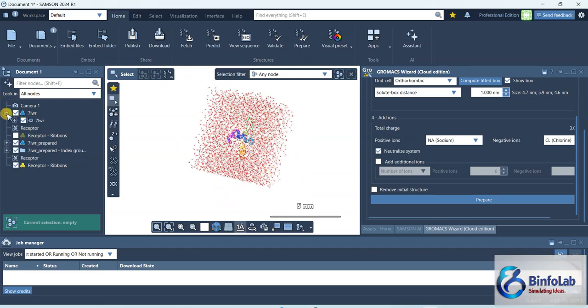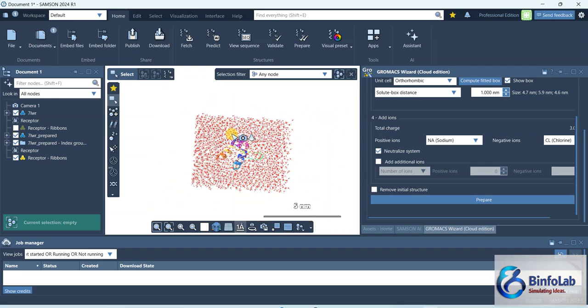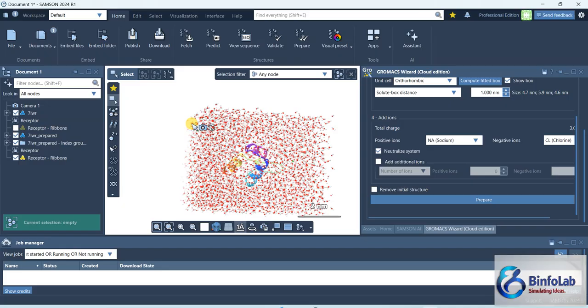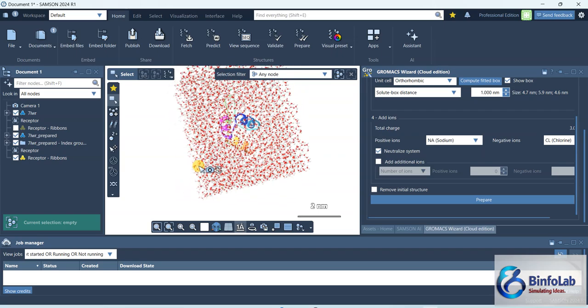I didn't check it, but anyway, the basic thing is to understand; in your case, it will not be like this. I had some extra selection which I did not ignore because I didn't see it earlier on.